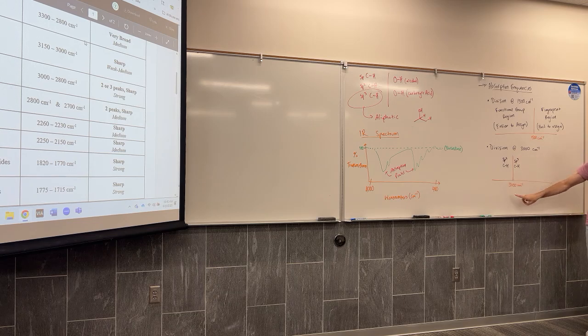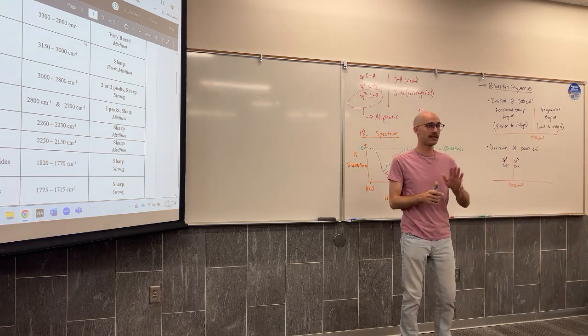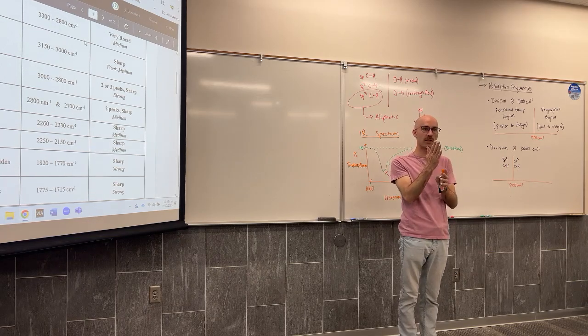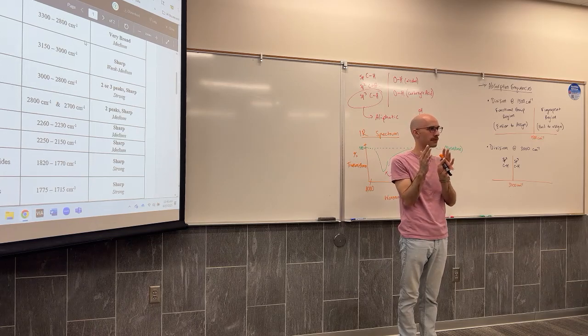I give you a dotted line at 3,000, and I give you a dotted line at 1,500. And that is meant to be a reference point for you guys. You do not need to analyze bond types below 1,500, and it helps you distinguish between the sp2 and the sp3 bond types at 3,000. So all of the IR spectra that I will give you will have those lines.